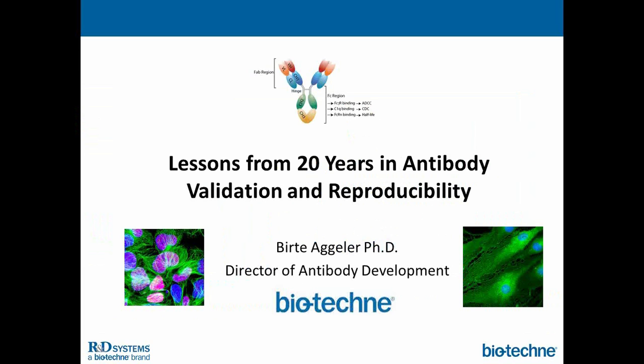So let's go back to the example I had on the eNOS, where we did see some induction, but we had a high basal level. So exactly. So you have multiple options at that point. What we ended up doing is, the first thing is you can tighten down your primary. If you have a very high affinity antibody, you will overwhelm the system, and you can force any phosphoantibody pretty much to recognize also non-phos if you really intend to do so.